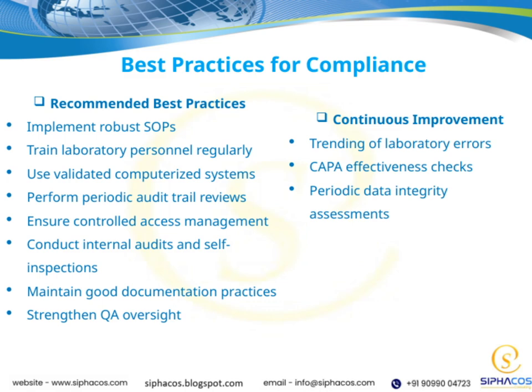Performing periodic audit trail reviews helps us monitor changes and maintain data integrity within our systems. Controlled access management is another critical point. Limiting access to authorized personnel helps protect sensitive data and prevents unauthorized modifications. Internal audits and self-inspections are powerful tools for identifying gaps and ensuring continuous compliance.